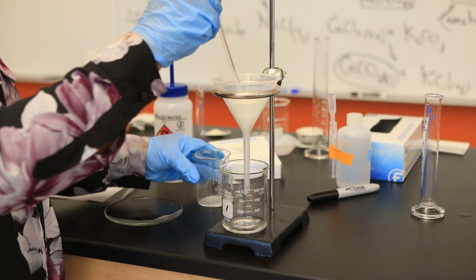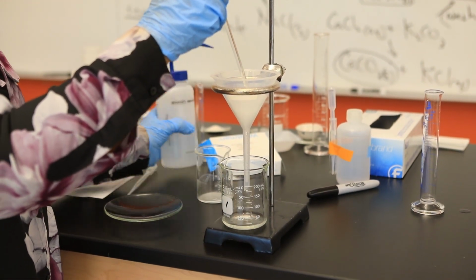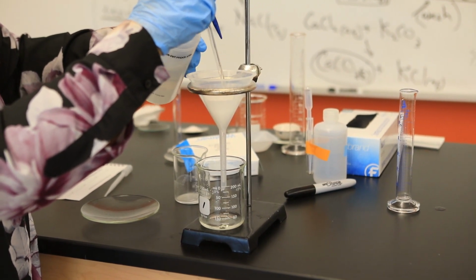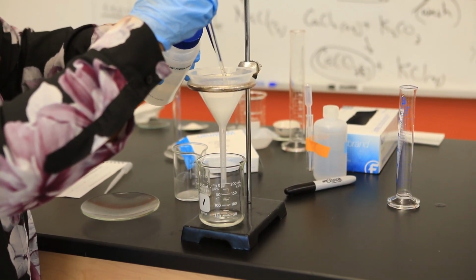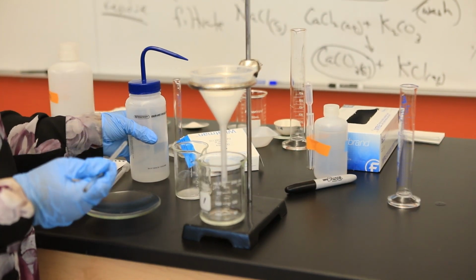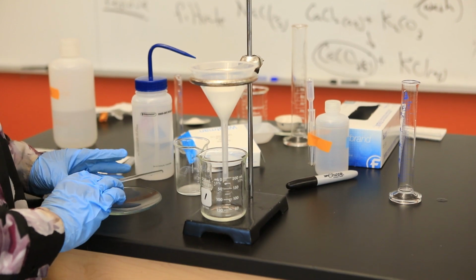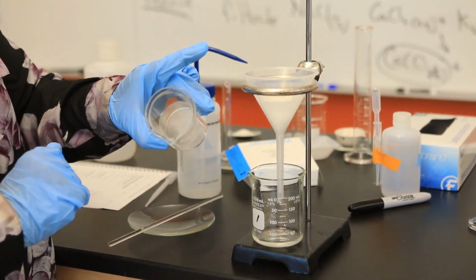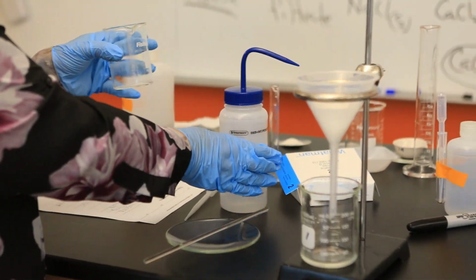Alrighty, so again at the end, remember what I said to you earlier, the goal hopefully is that we recover this as much as possible. It'd be nice to get 100% recovery. And if you do, there's a good chance that your compound could be wet. So that doesn't mean you're perfect or I was perfect. However, there is still solid remaining in my beaker.